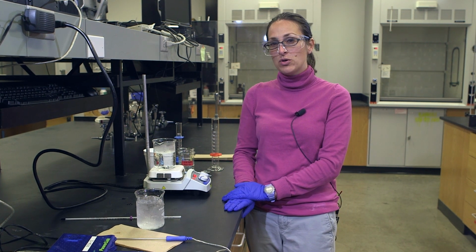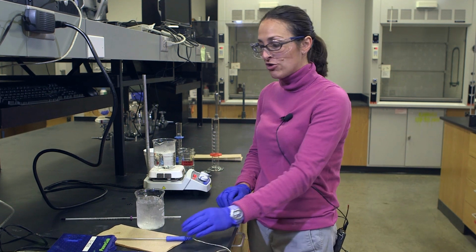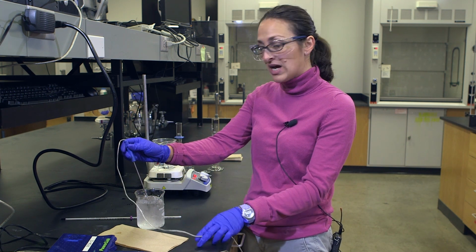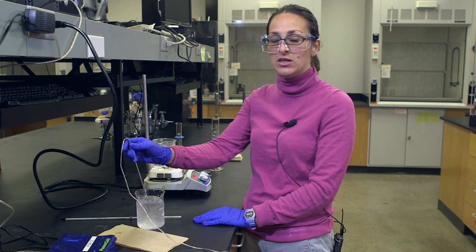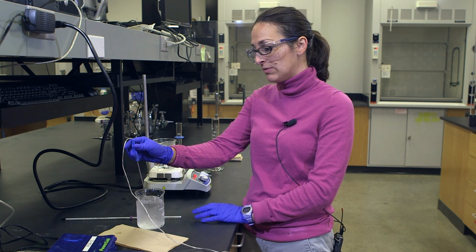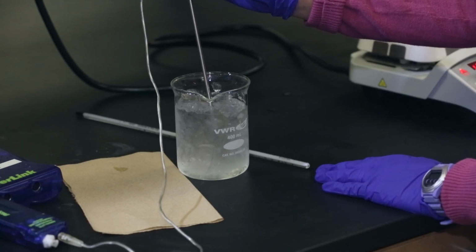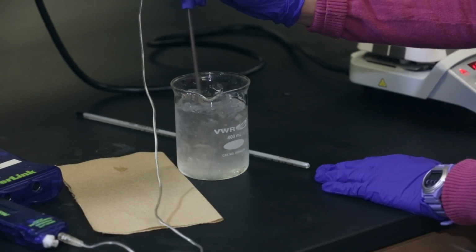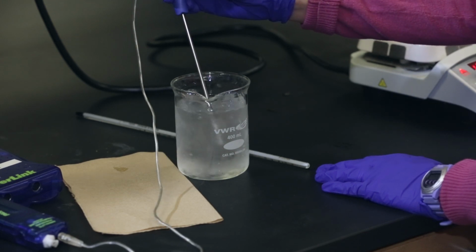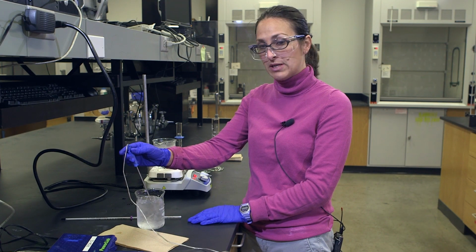The first step in both of these experiments is calibrating your temperature probe. So first we want to have a lower point. So I have an ice water bath and I've let it sit for a little while to make sure that the water and the ice are in thermal equilibrium, so that water is cold. If I just add it, the water's not quite cold yet. So I want to make sure that some of that ice has melted. And I'm going to enter on the computer 0 for this lower temperature limit.